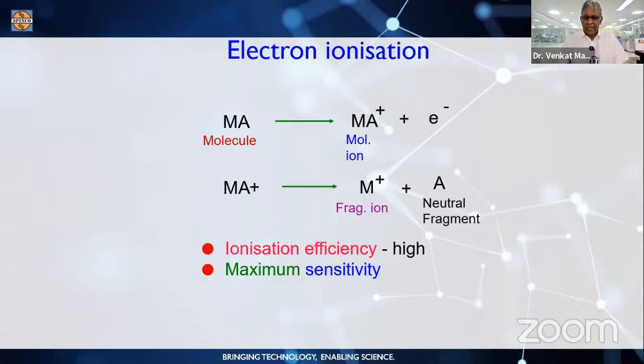Excellent. Sir, if that is the case, I am working on an unknown molecule. When I am working on an unknown molecule, how will I get the information? Because I do not know whether this is the molecular ion or that is the molecular ion. If I get only the fragmentation, don't worry. Very simple. Because the mass spectrum is the fingerprint of your compound.